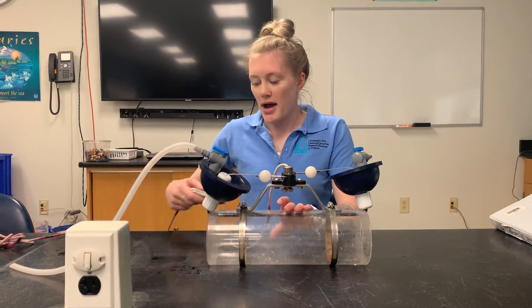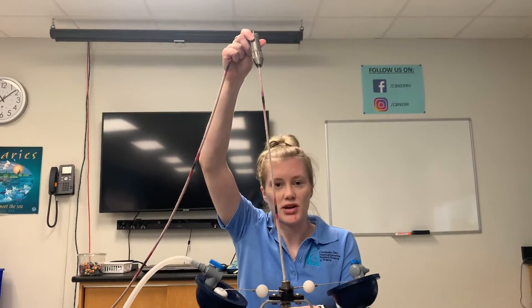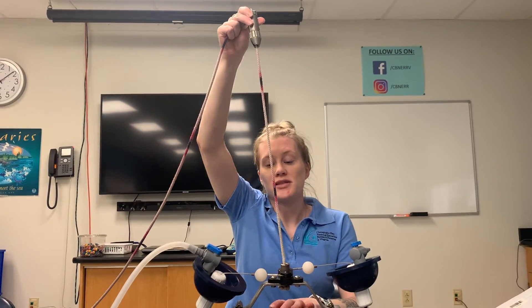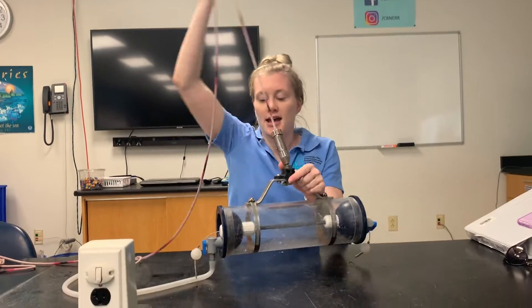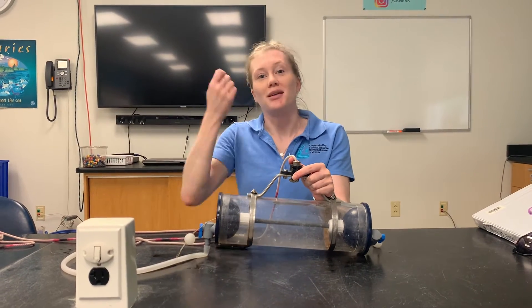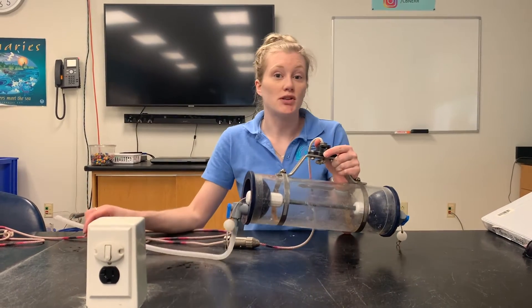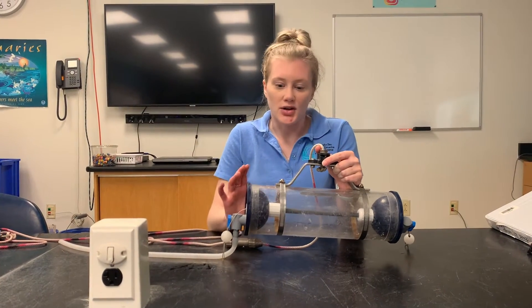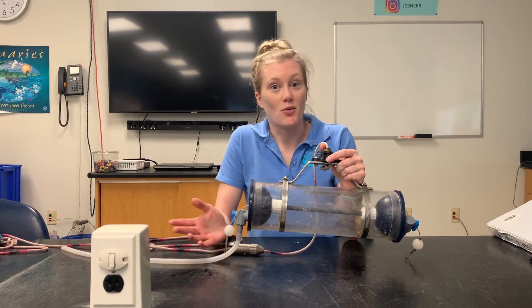The rope has pink marks on it, pre-measured to show how deep you're going, along with a metal weight. Once you're at the depth you want, you drop the weight, which seals the sides and locks in your sample. Then you bring it up to the top of the boat and use this little valve to retrieve individual samples, allowing individual sampling of the water collected. This is a really good piece of equipment for basic water quality needs.